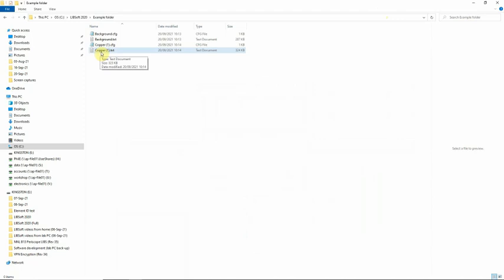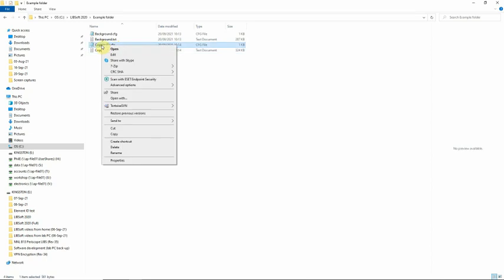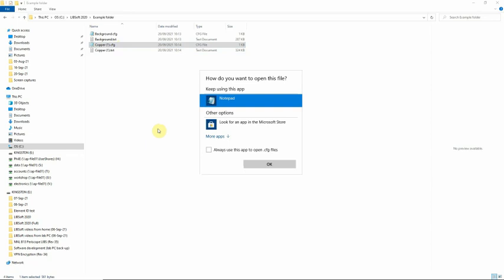The spectrum file is saved as a text file with the sample name followed by the file increment number in parentheses. In addition to the spectrum file, there is a parameter configuration file that's also saved, and this is a .cfg file. It has the same name as the spectrum file, but the file extension is different. This file records the parameters used for the acquisition of the spectrum. It's a simple text file and can be opened in most text editors, so we can open it with Notepad.